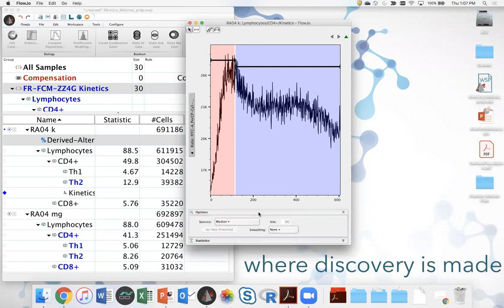So let's open up the options menu here to start. First off, it's asking what statistic we'd like to see for the y-axis. Median seems fine. You have the ability also to choose mean, geometric mean, or percentiles, depending on what it is you're looking for. There's also another suite of options that are the percent regarding some threshold. The most common choice for this is to use, if there wasn't a data set, the steady state portion leading up to whatever stimulation event occurred as the way to mathematically define a threshold.